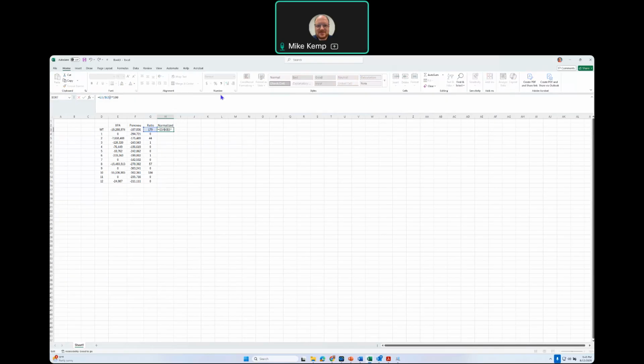If you put the dollar sign before both the column and the row number, it will keep that constant. So if we copy and paste that down, I'll get rid of all the extra nonsense digits. Now, if you look down here, again G3 divided by G3, now G4 divided by G3, G5 divided by G3. So again, it normalizes each of these numbers to the wild type.